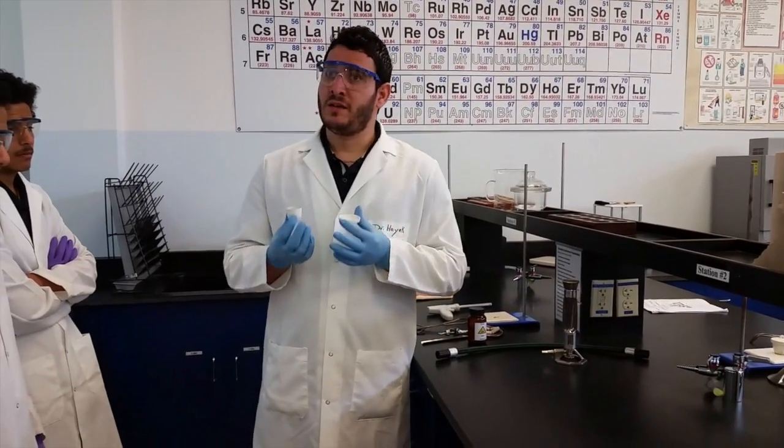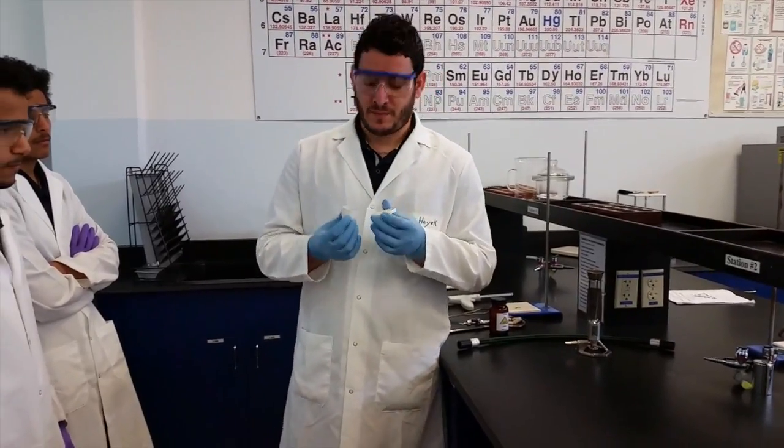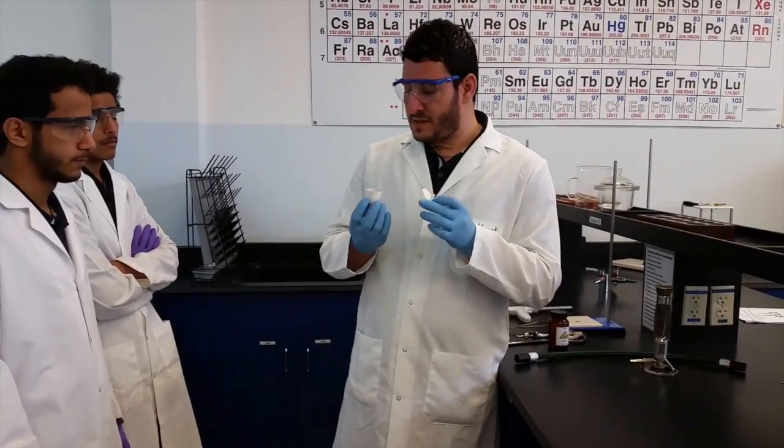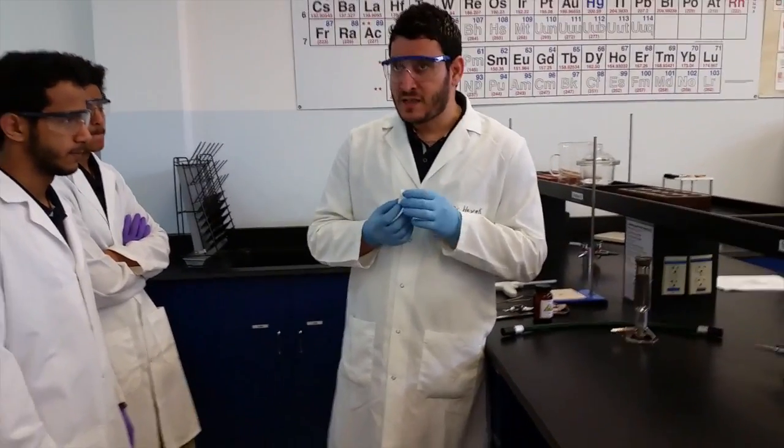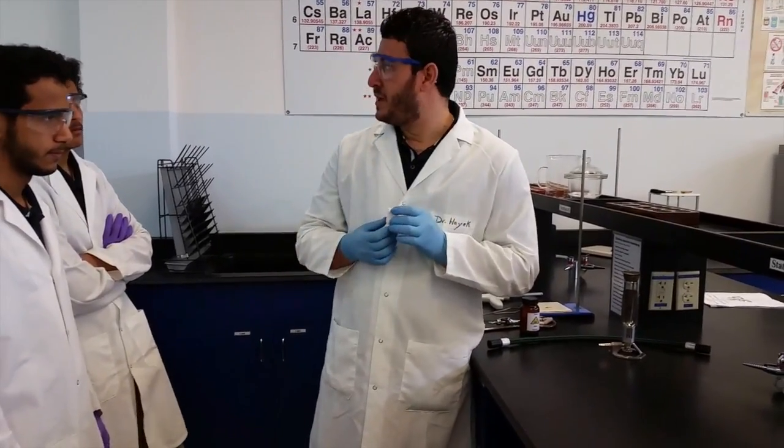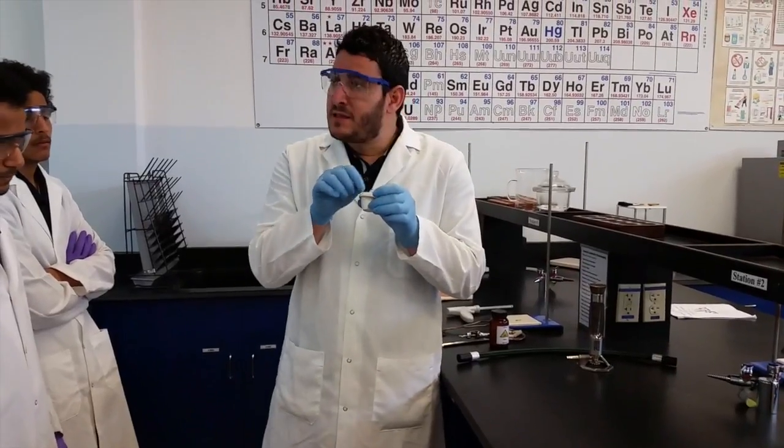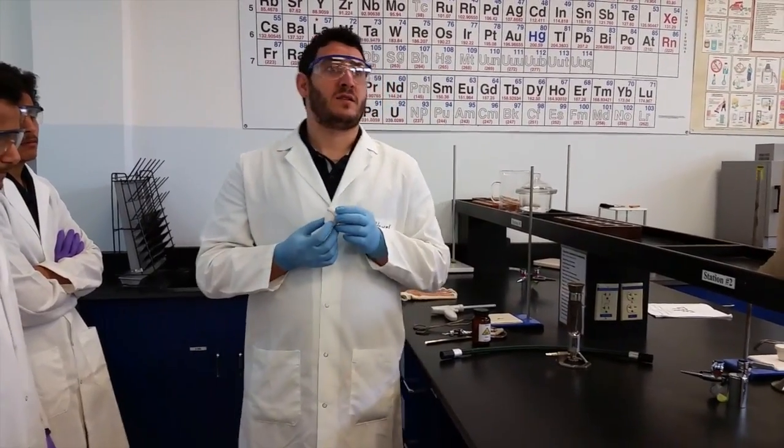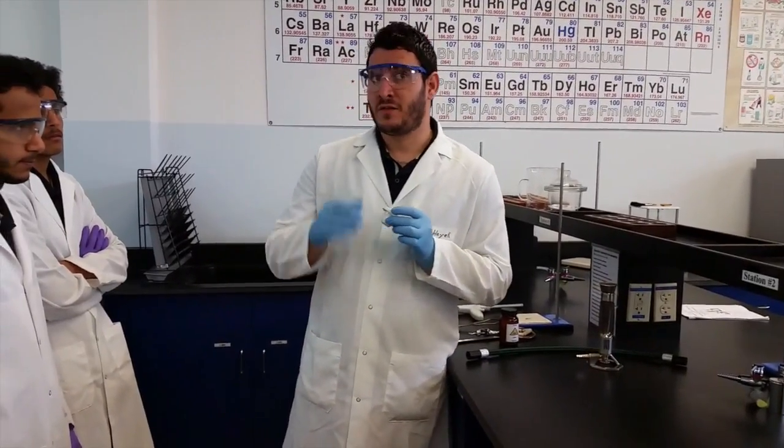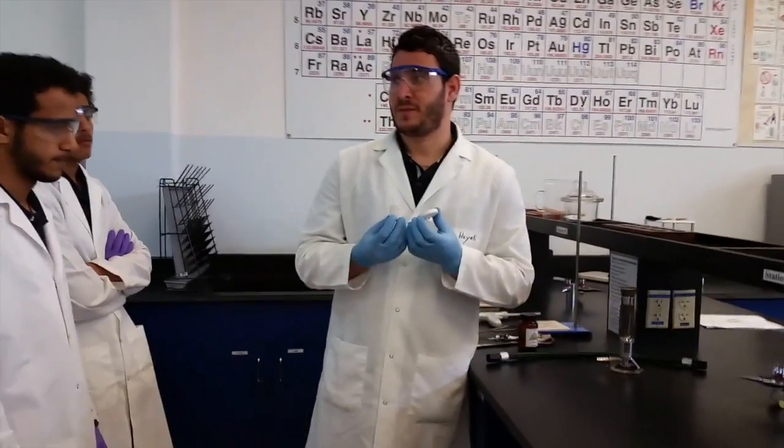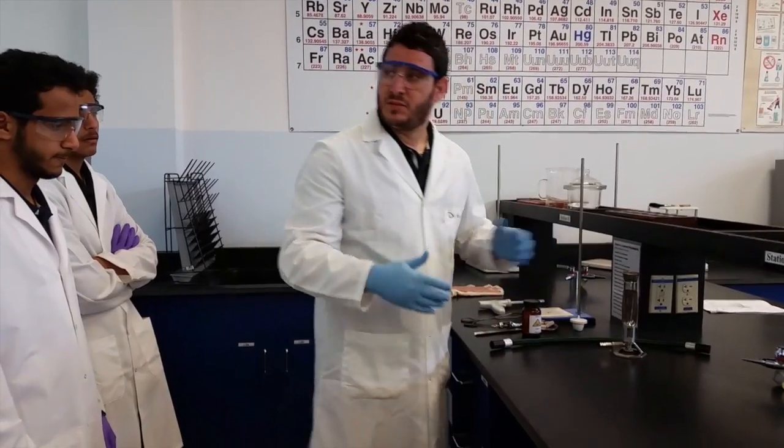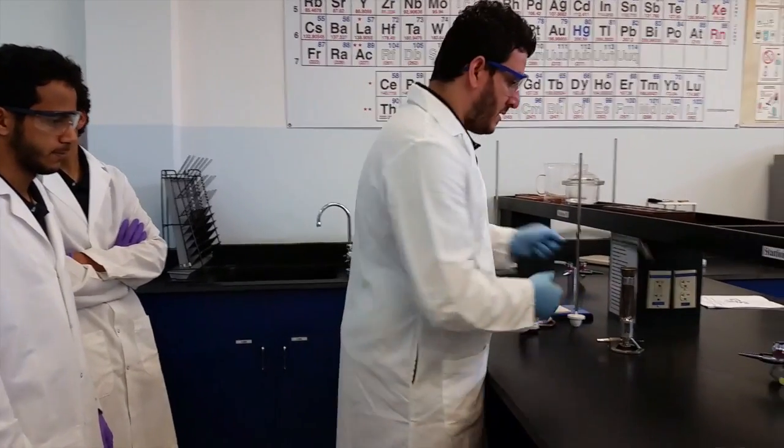The very first thing you need to do is weigh the crucible empty. The crucible is made out of porcelain, which is porous - it has pores. Water vapor from air can come and sit inside. This water might give some error to my experiment, so I need to get rid of it before I weigh the empty crucible. The best way to do this is to heat it up a little bit.